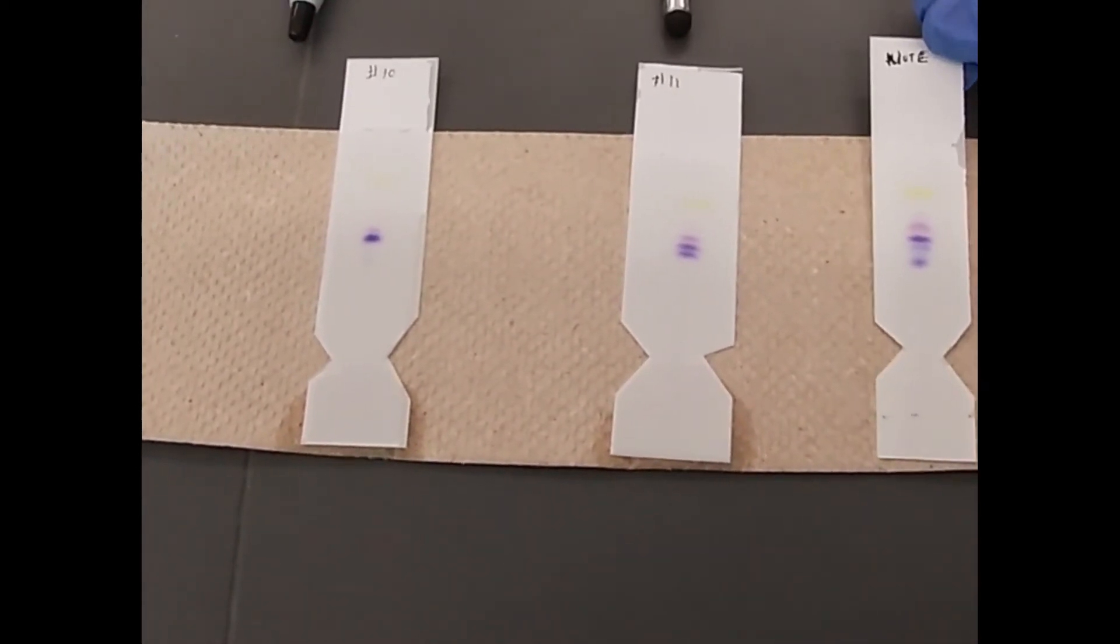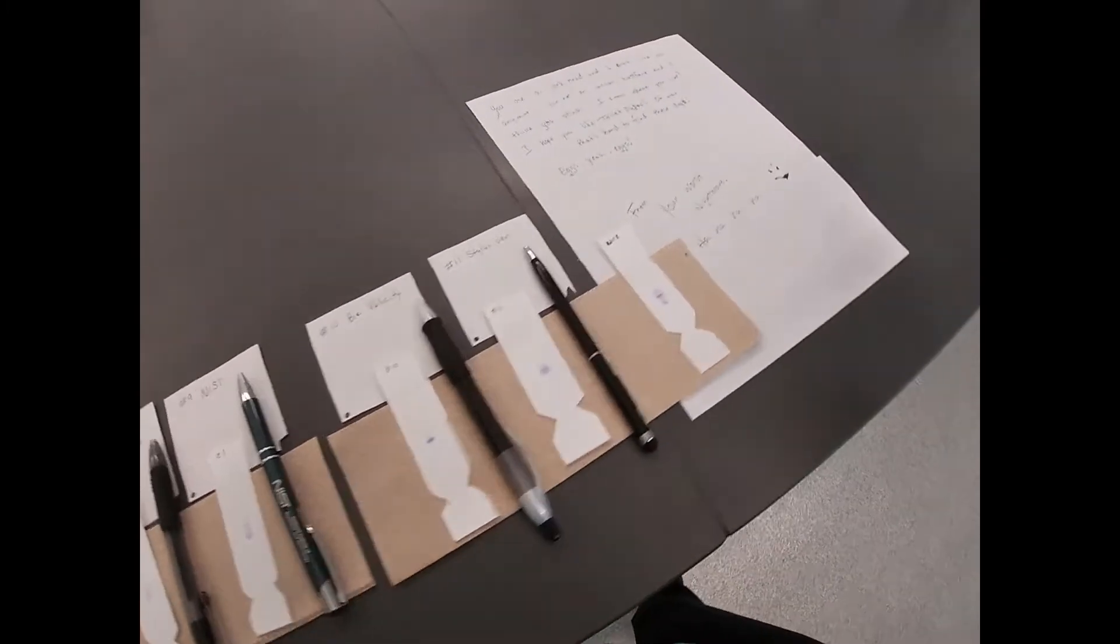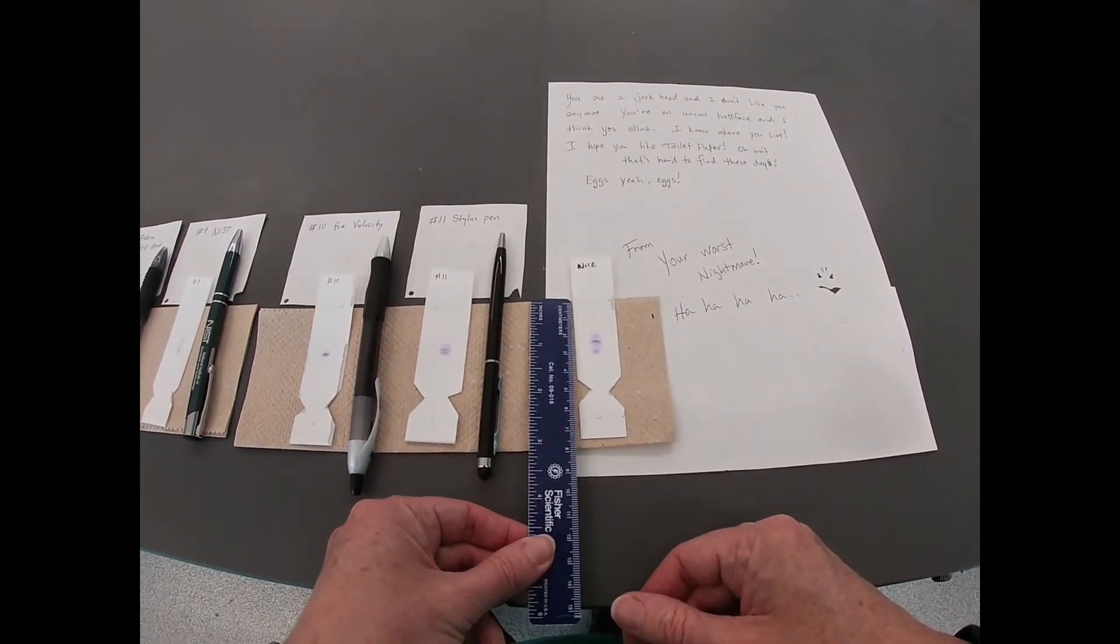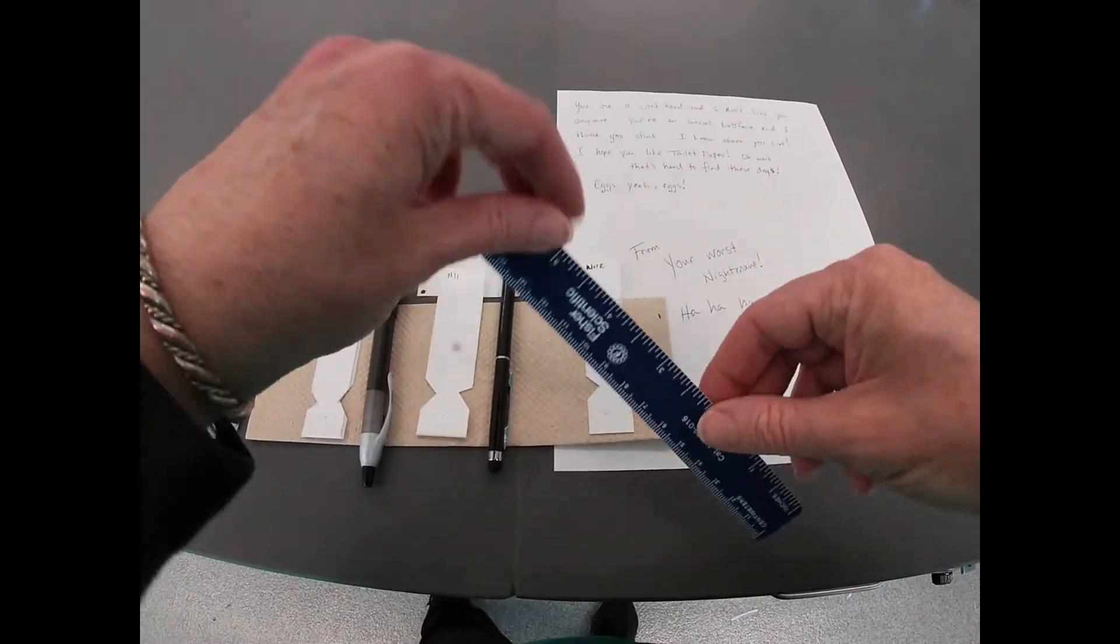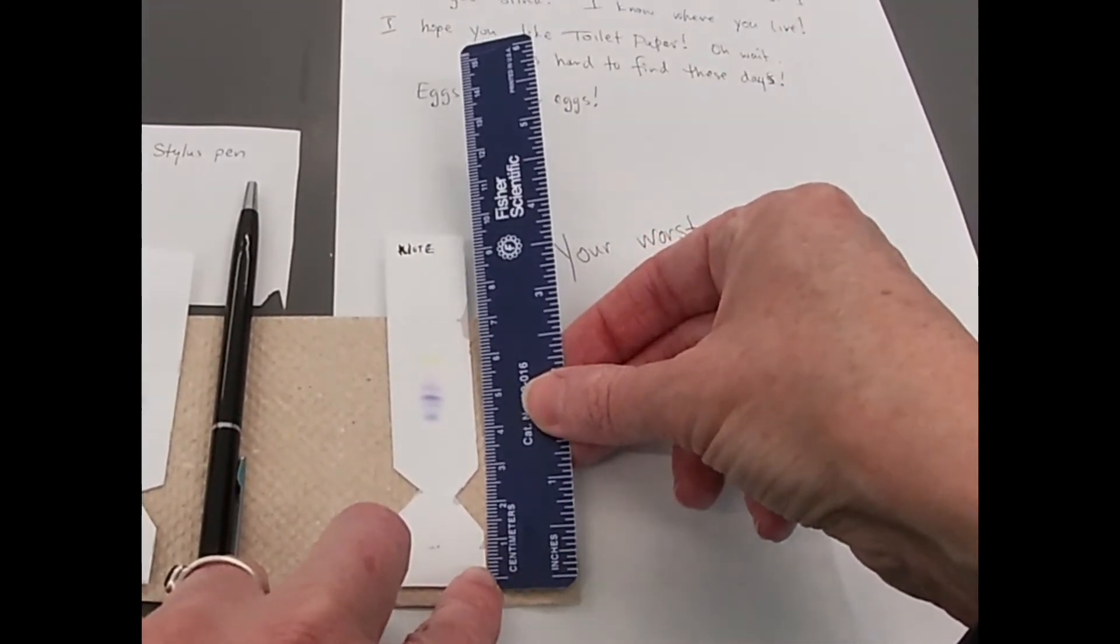Again, things might become even more clear once everything's dry. All right, so when we calculate our retention factor, basically what we're going to do is figure out how far each of the bands here moved relative to the solvent front.